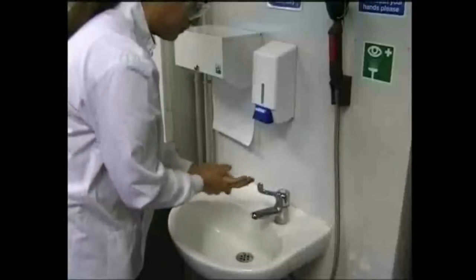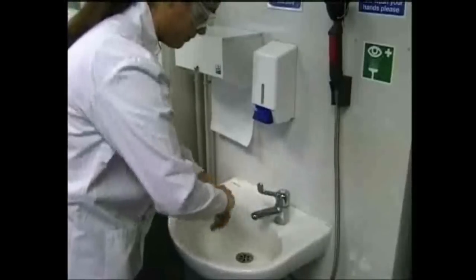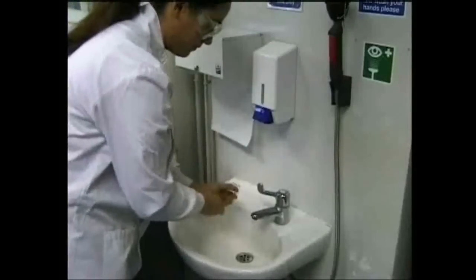Never eat, drink, or chew in the lab. In fact, nothing, including fingers and pens, should be put in your mouth. Never pipette by mouth or lick labels.